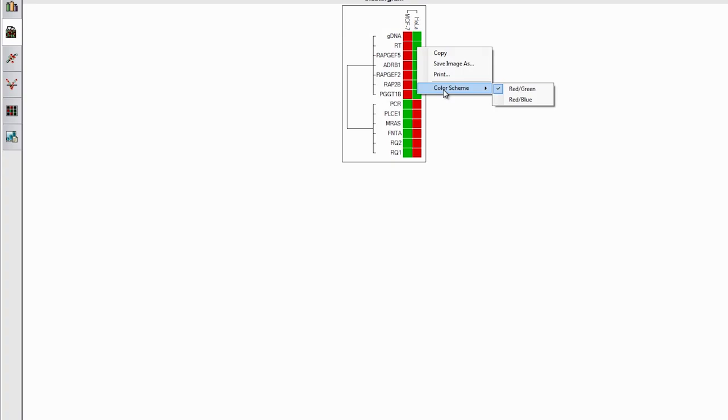One nice feature is that you can change the color scheme, if you wish, by right-clicking any box and selecting Color Scheme.